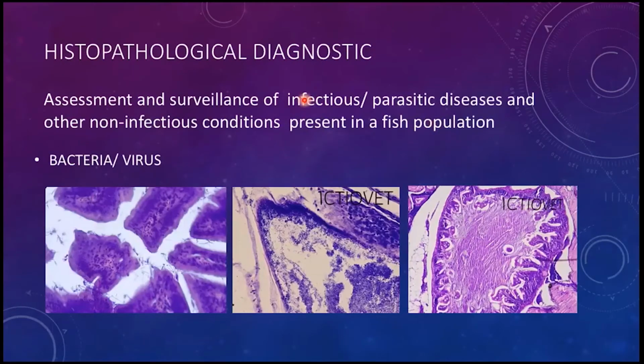When we perform histopathological diagnostics, we are basically monitoring the presence of infection, parasitic diseases, and other non-infectious conditions in a fish population.